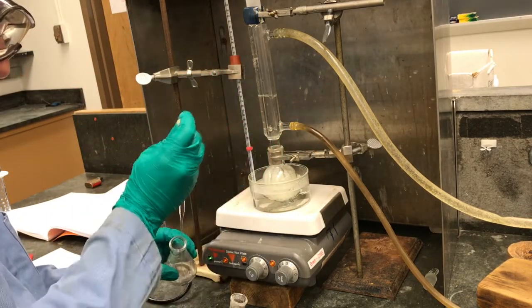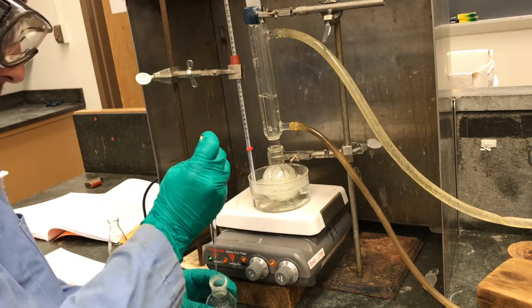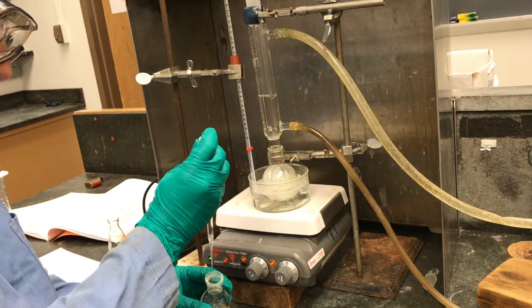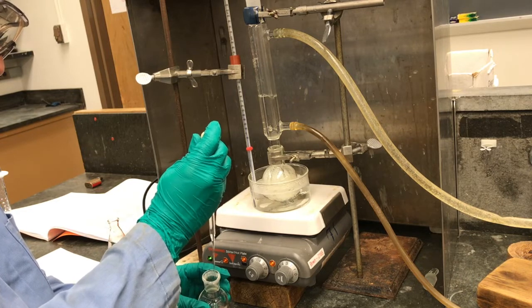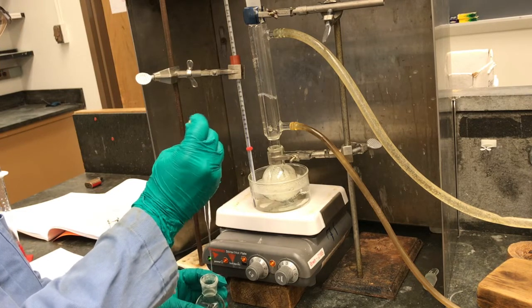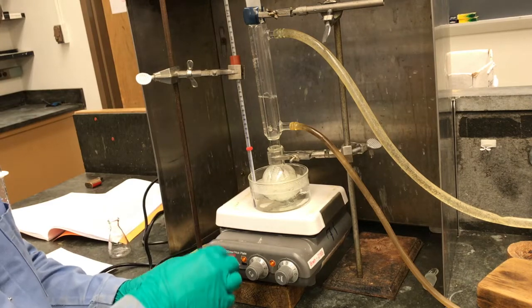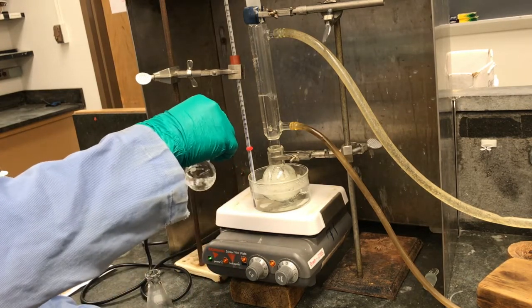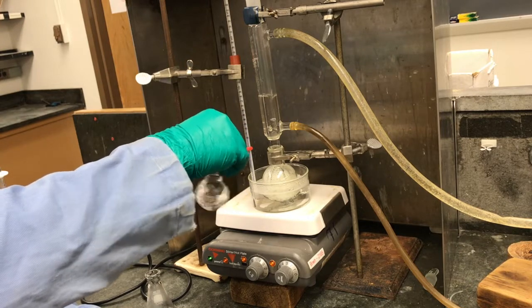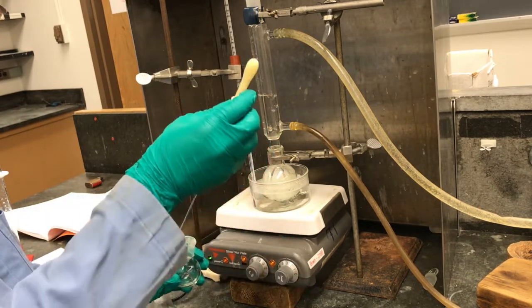It took about 4 total milliliters of hot methanol to get the p-nitrobenzaldehyde to completely dissolve. And then once we got it all dissolved, we're just going to add it to the top of the reaction through the reflux condenser.